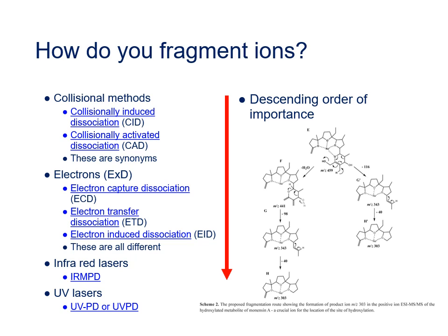Well, clearly we've got to put some energy into the ion in order to get it over the fragmentation energy barrier. So all the different fragmentation techniques used in tandem mass spectrometry are just different methods of depositing energy into ions. The most commonly used methods are the collisionally induced methods, so that's collisionally induced dissociation or collisionally activated dissociation. And these account for by far the largest proportion of all tandem MS experiments.